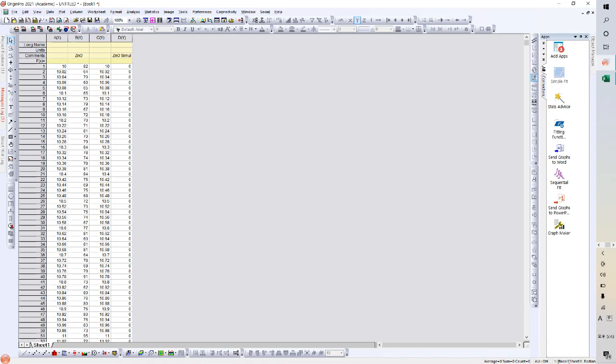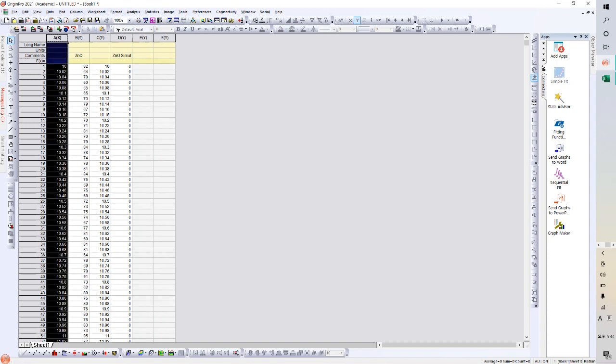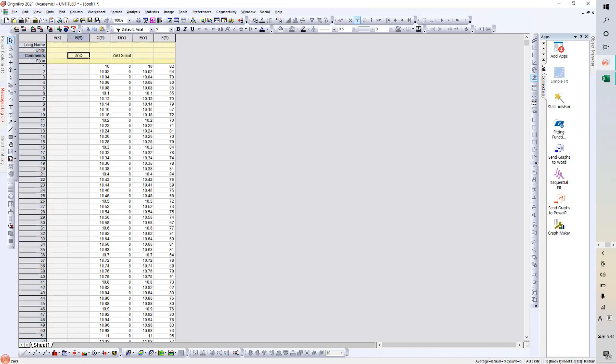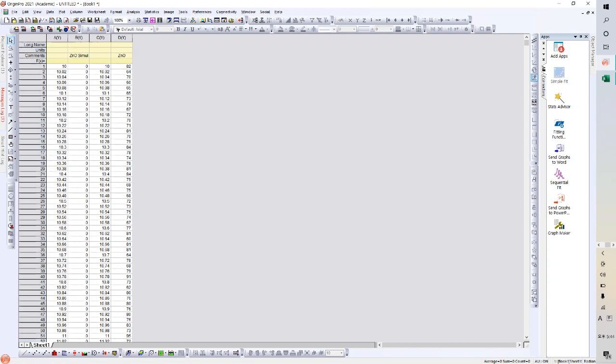In ordinary cases, however, the simulated data should be at the very bottom, so that the actual zinc oxide that we synthesized can be compared based on that. So we will change these two bars. We changed the sequence. And did you notice that all the A, B, C, D lines are representing the y-axis? We also need to change it.